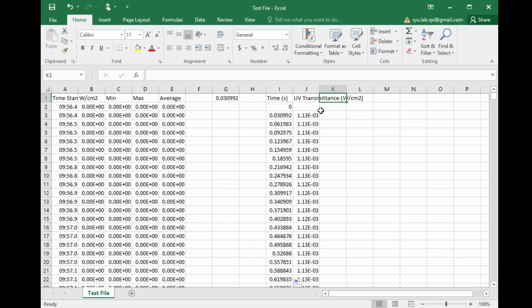So now going back to this empty cell for the UV transmittance that I had left there from the start, essentially what you would put here at 0 seconds is the value of UV transmittance that your sample provides when it is not polymerized at all, when it is not subjected to any UV light. And essentially the way that we gather this is by using an external standard.